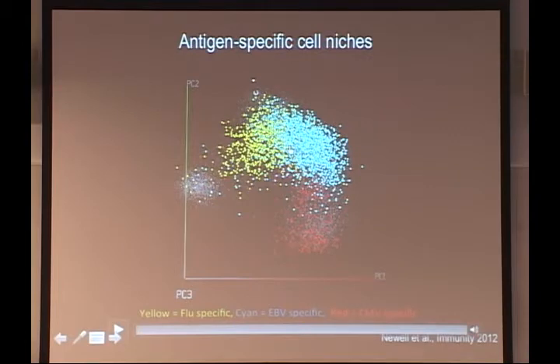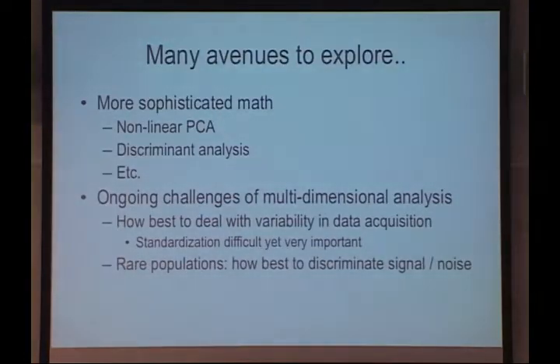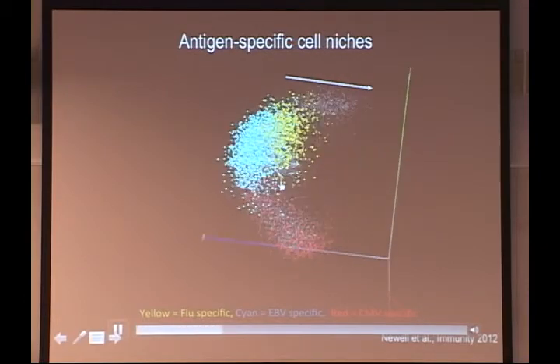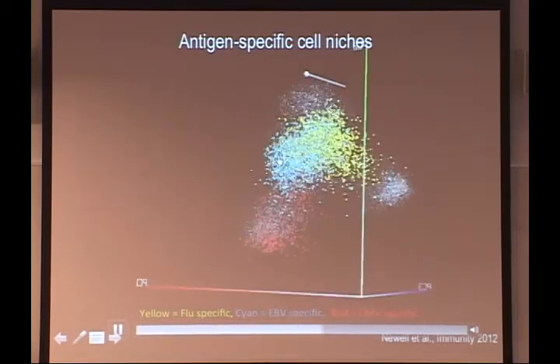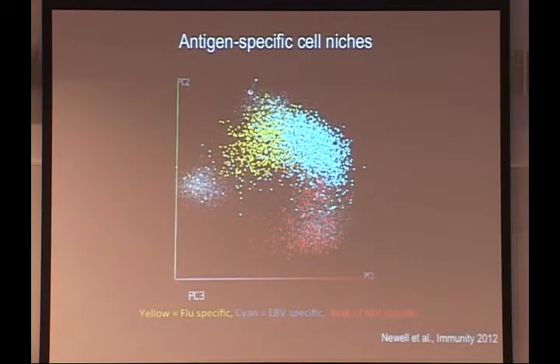And you can see this is just one example. There's diversity between people and between epitopes. But in this example, you can see that they sort of occupy different regions of this. And this is representative of a lot of donors I've looked at, where CMV-specific cells, more of them are further down on this differentiated branch, and EBV-specific cells are sort of all around, and flu-specific cells are mostly in the central memory compartment.